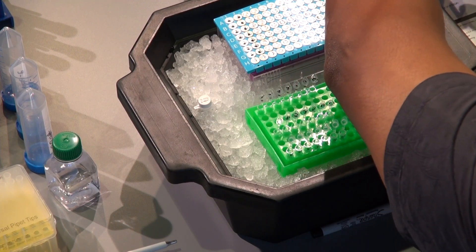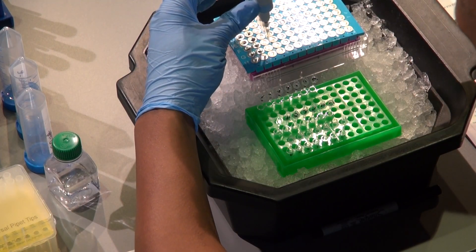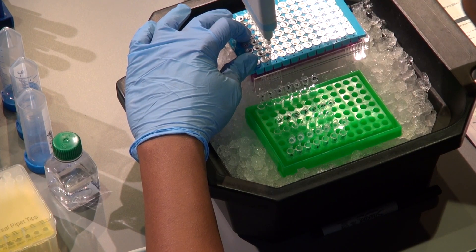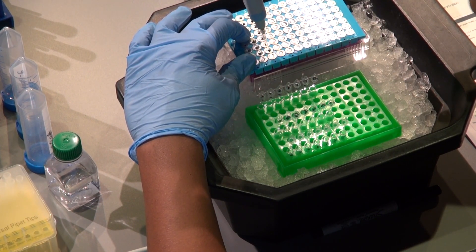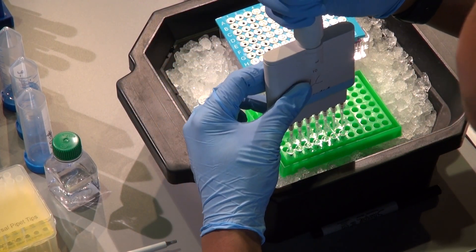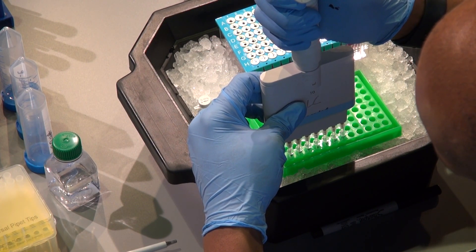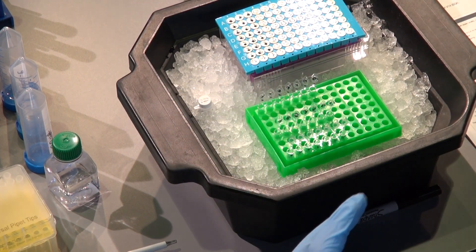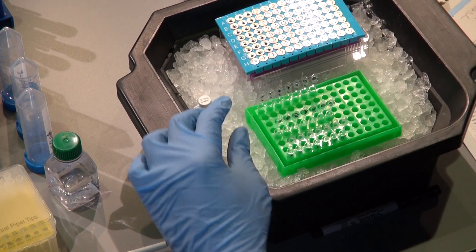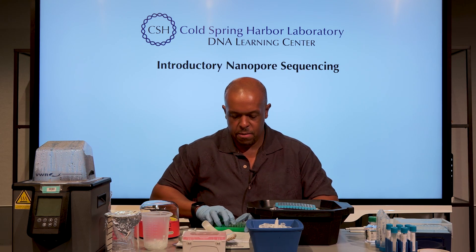I'm doing a replicate, testing a different PCR mix. Visually confirming that I have that volume. Now I'm going to cap that up and get it off the ice just so I can really seal this.